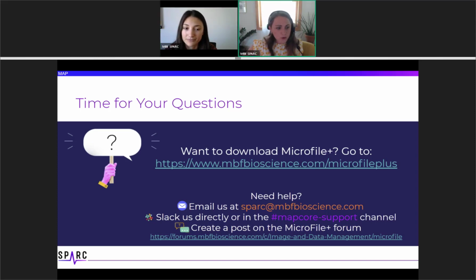No, they do not. Only what's considered the source microscopy data that you use for analysis. So not ancillary supporting images for documentation or things that you would normally put in a publication. Just the data products suitable for analysis are covered.